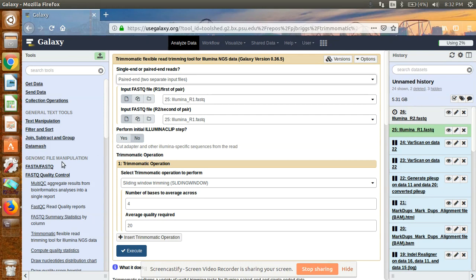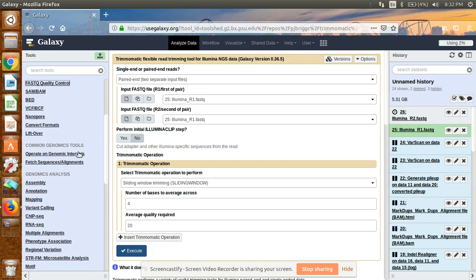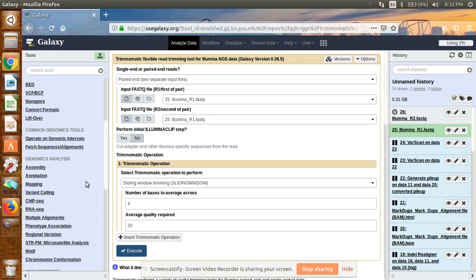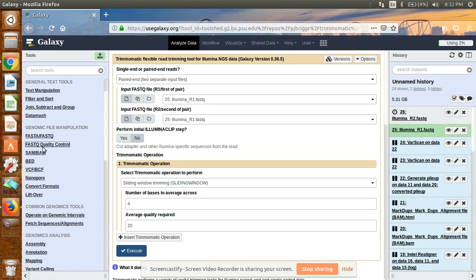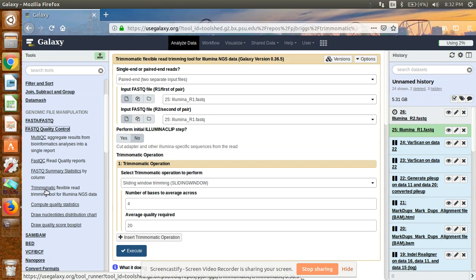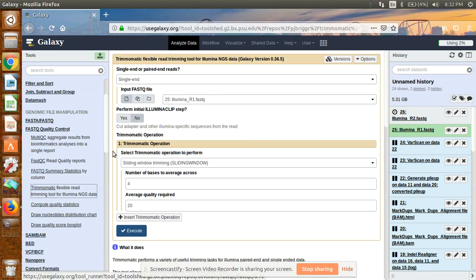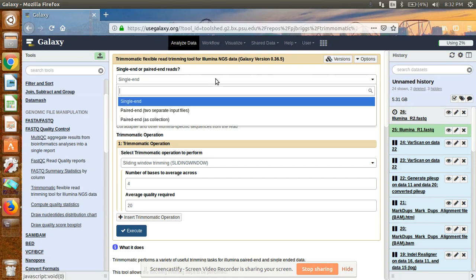On the left side of the Galaxy server there are different tools you can use for analysis. For trimming, go to FASTQ Quality Control and click on it. Here you can see there are different tools available, but I use and suggest Trimmomatic, which is cited by many researchers in published papers. Click on Trimmomatic.